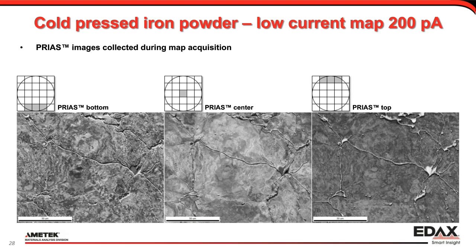If you take a similar image, but then using the signal from the middle of the phosphor screen or the chip, then you get not as detailed, so you don't see the substructure so clearly, but you see the overall structures. The larger grain structures are very nicely resolved, and it's not sensitive anymore to topography. So the topography that we saw on the left image is almost gone.